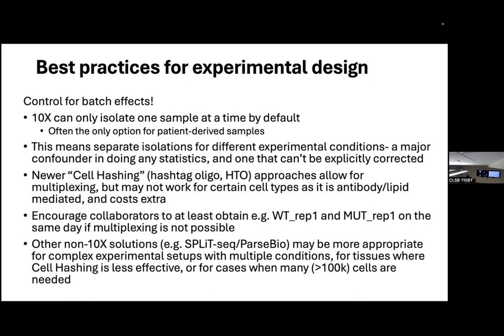Right, so some of this comes down to the definition of what a biological versus a technical replicate is. There may be value in doing either or both of those.